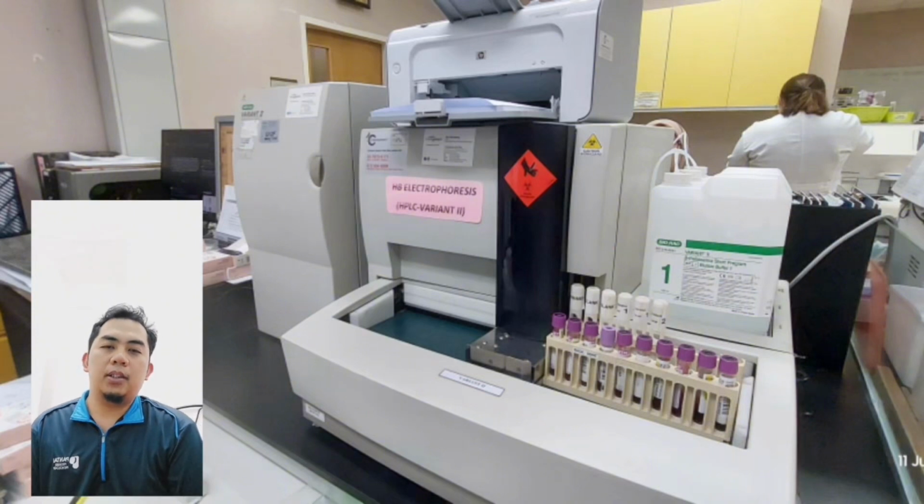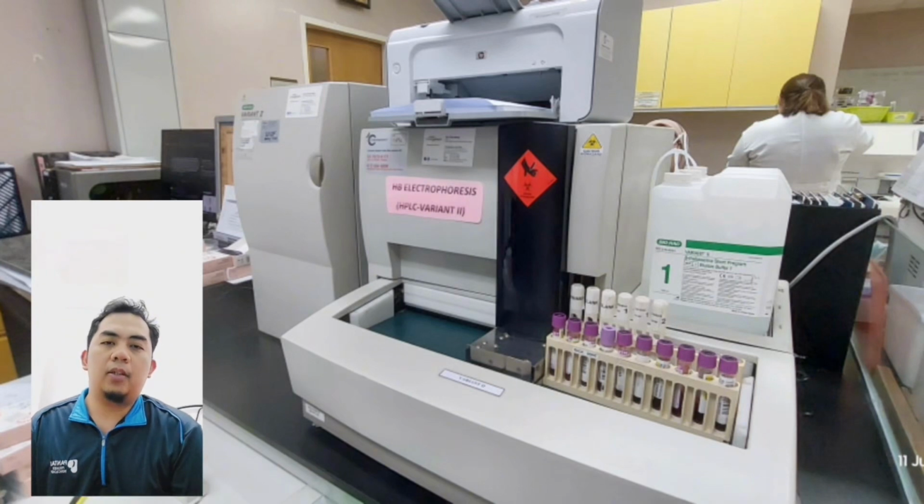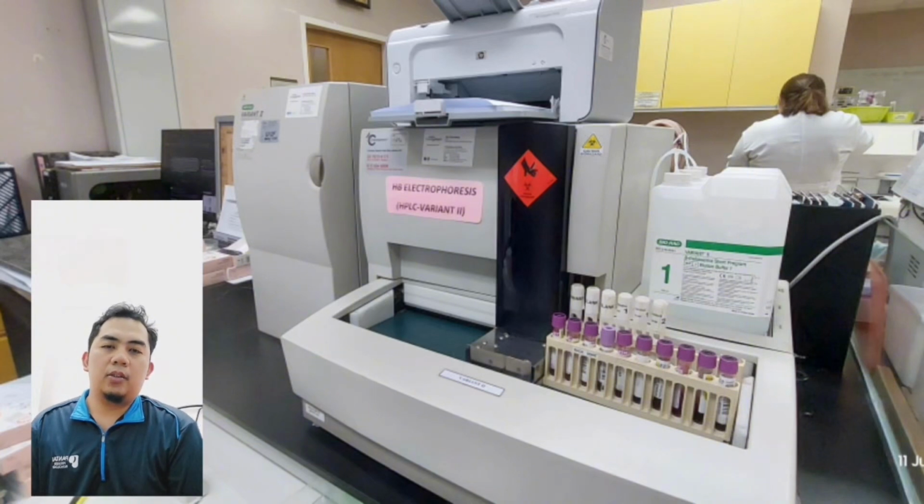An example in the medical laboratory is that HPLC is used to detect beta thalassemia, abnormal hemoglobinopathies, and also HbA1c. This application shows how important HPLC is in both research and quality control.